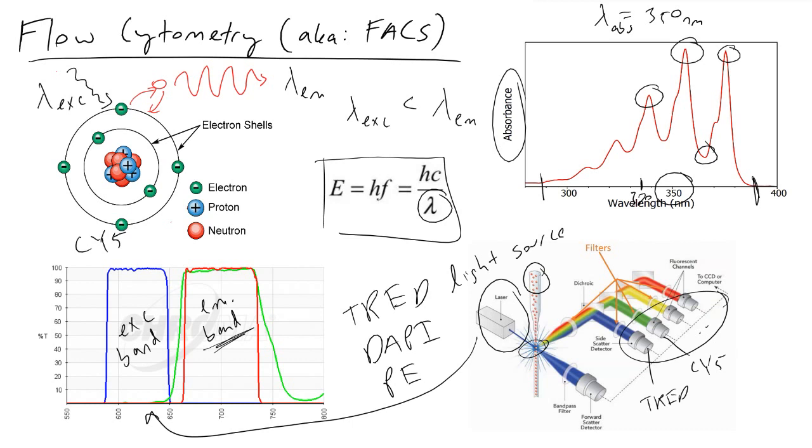We're just reporting the peak absorption because it's an easier number that we can quickly toss around and share with people rather than a range. So it does not do it full justice, but it does help us refer to these fluorophores and determine whether or not they would fall within a particular excitation band.